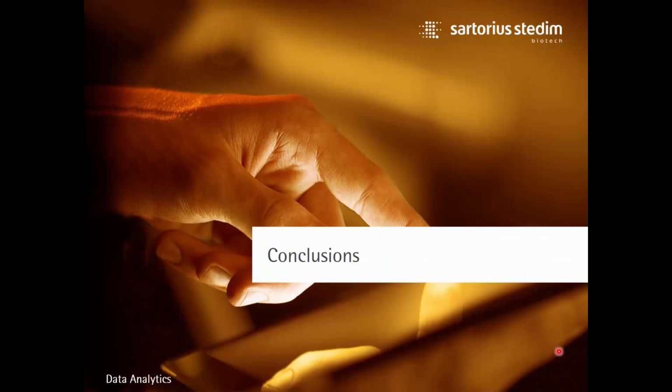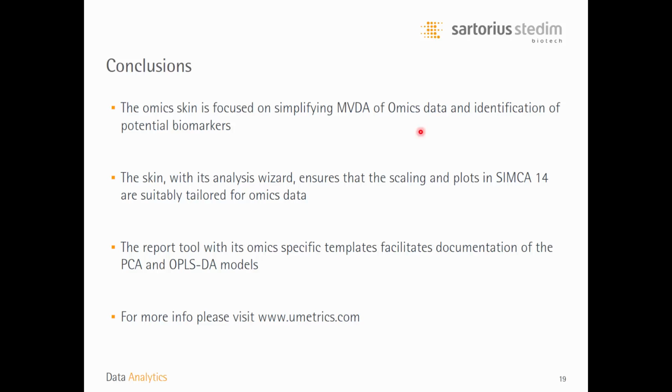So with this little demonstration in mind, we are now moving over to the conclusion part. And we can say that the reason why we have developed this omics skin is that we would like to simplify the use of multivariate data analysis of omics data for people that have an interest in identifying potential biomarkers that can separate the groups they are analyzing.